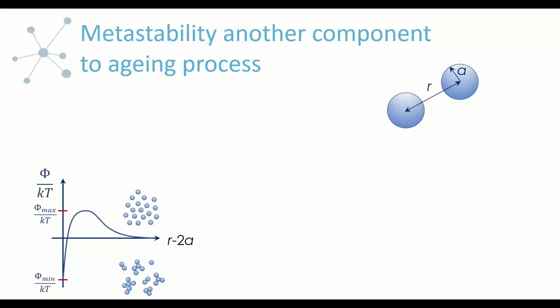And we can estimate the time scale that this can occur using the diffusion equation. So this is the standard 2D diffusion equation where we have diffusivity, time, and then the area length scale that these proteins diffused. And so if you remember that giant yellow particle on my previous slide, this area here is the area that that particle has diffused over this given length scale for time tau.